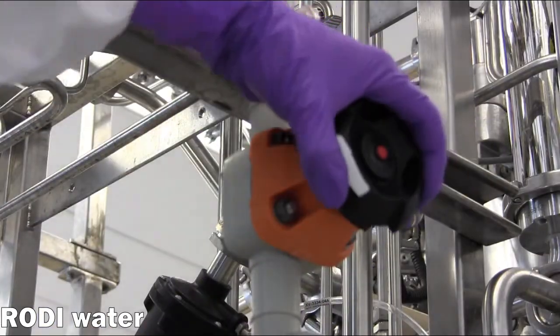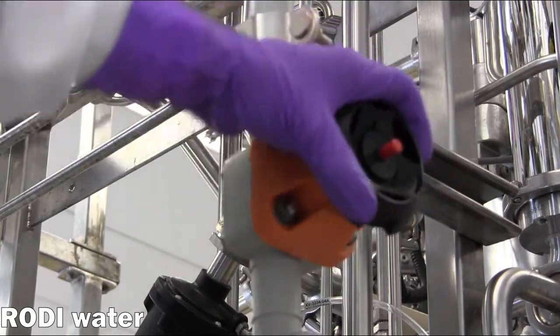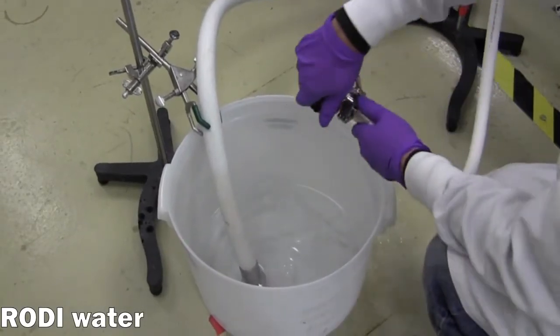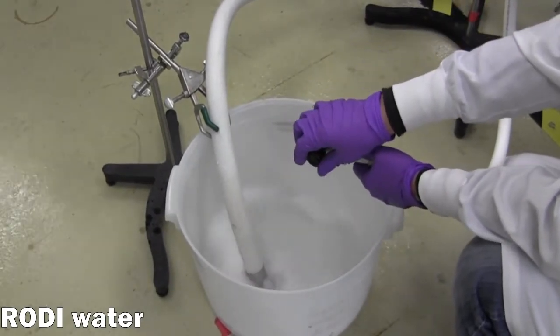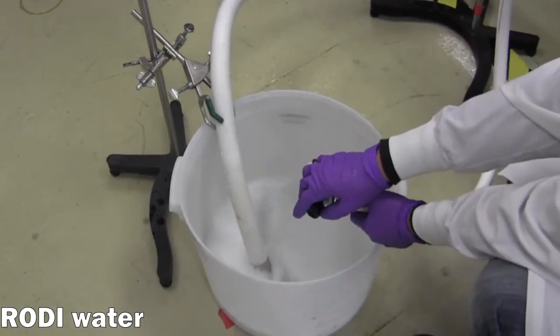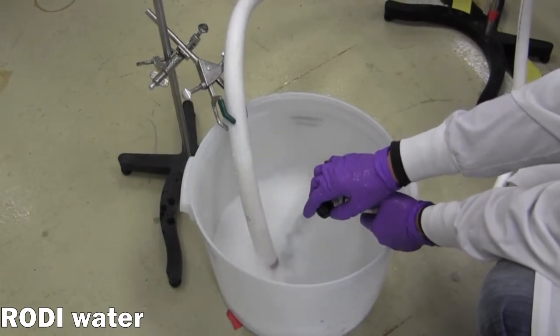Next, the supply valve for the RO-D water is opened. An RO-D water hose is used to supply water for priming and cleaning tasks throughout the operation. Here, a bucket is filled with water that will be used in subsequent steps.